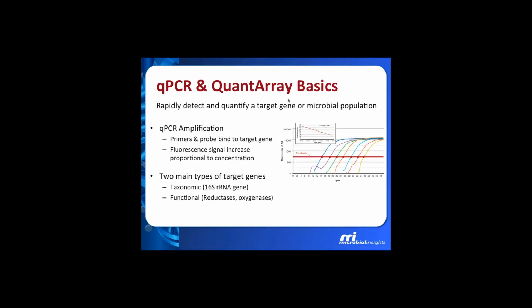So as Brad was saying, it gives us that direct line of evidence of what's happening with the degradation. And there are two types of genes that I just mentioned that we can look at. We can do a taxonomic identification that will tell us who a microorganism is, very useful at sites for reductive dechlorination when we're talking about Dehalococcoides, for instance. We can also look at target genes, like functional genes for degradation. So that may be for if we have petroleum hydrocarbons at a site.